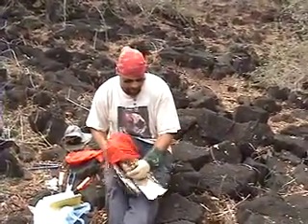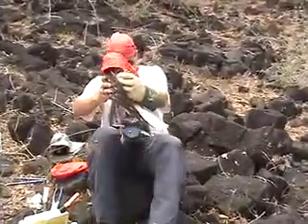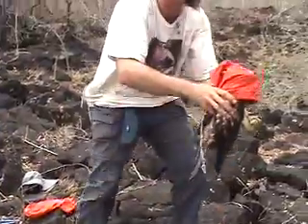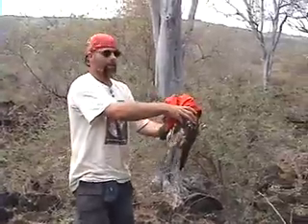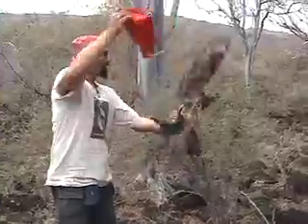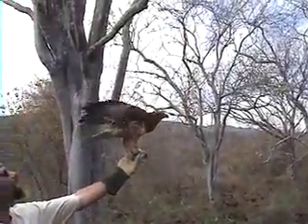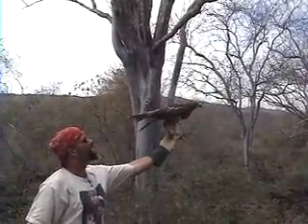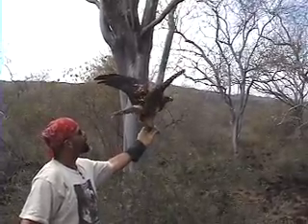We got the bands on and we're going to let him go. Hold on a moment here. Let's try to get up — there we go. Here we go. Whoa! How about that? Go ahead. Fly. Be free.